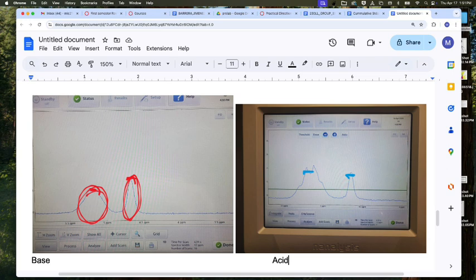We're already seeing a height difference, which means the ratio of those two, depending on our conditions, is different. Ooh, that's kind of neat. Because our mechanisms ran differently, we might see a difference in the amount of each of those products that came out. And we're doing this based off of the height.